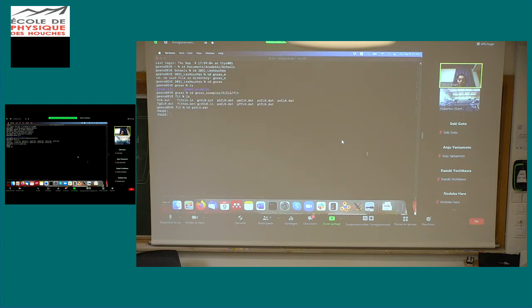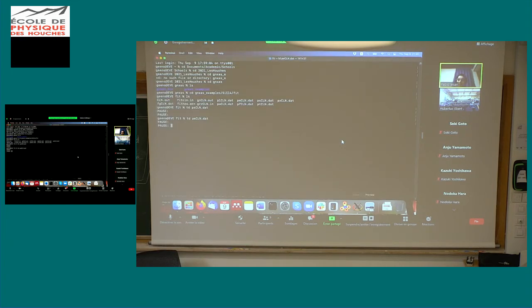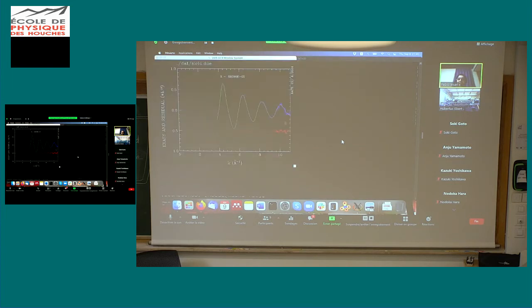Yeah, okay. So as you can see, this is the PE, so it's the fit. So you see in blue is the experimental data, and in green is the fitted signal. These dotted lines are the energy range that we didn't fit because there are glitches.